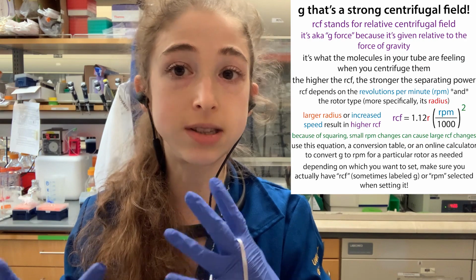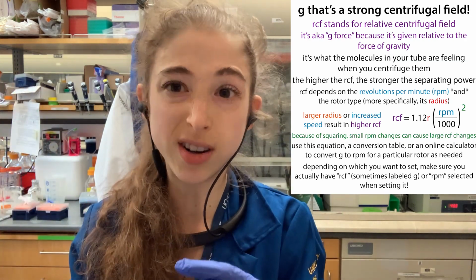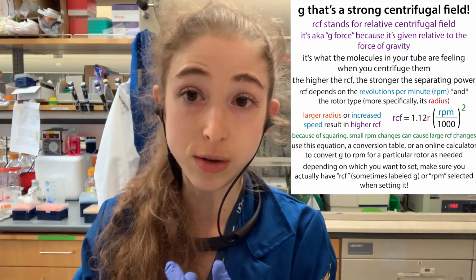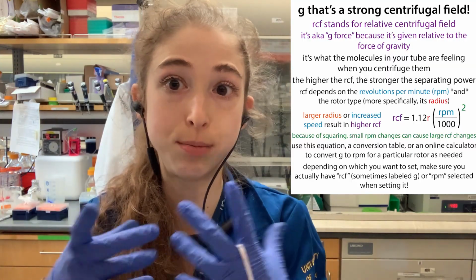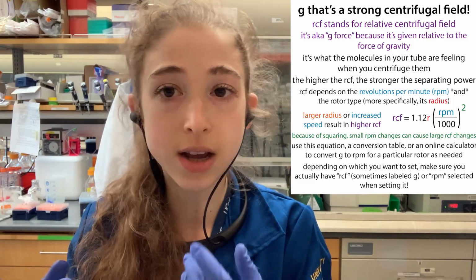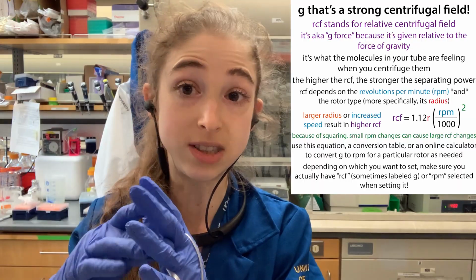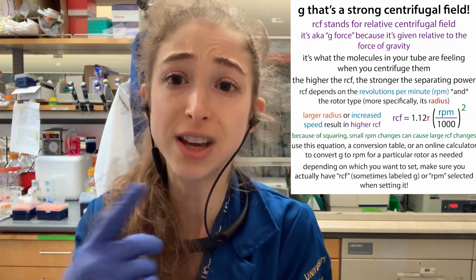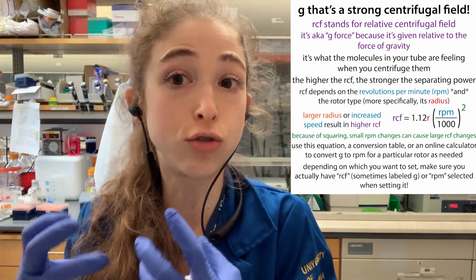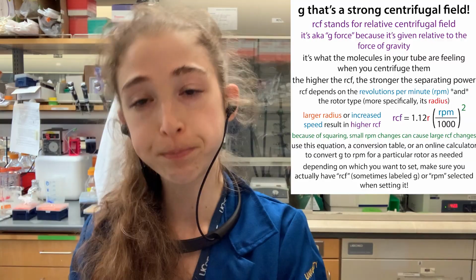Some centrifuges, you change out the rotor and they're really smart and they know what rotor you put in, or you tell it what you put in, and then it will do the conversion for you because it's got the radius programmed into it. Other times you have to do the conversion yourself, and it'll only be able to be set in RPM because that's all that the centrifuge itself can do. It can control the RPM. It can't directly control the RCF because that's also going to depend on the rotor.